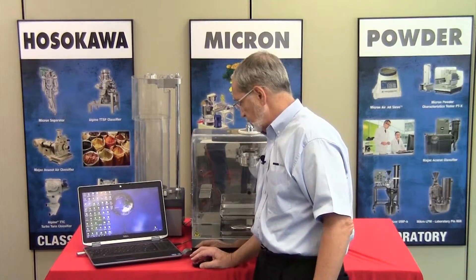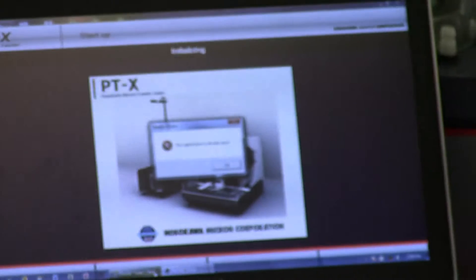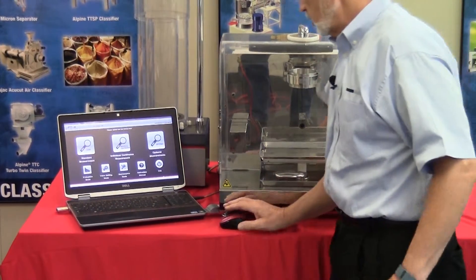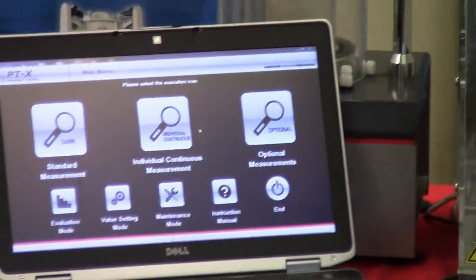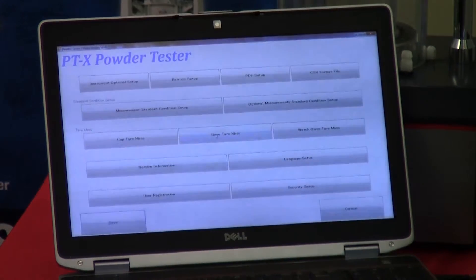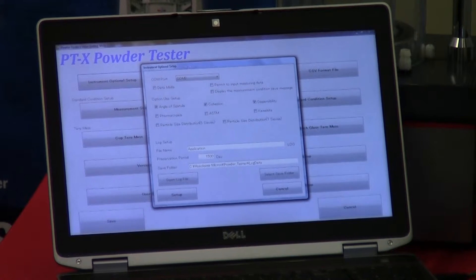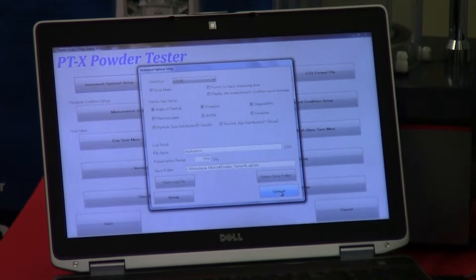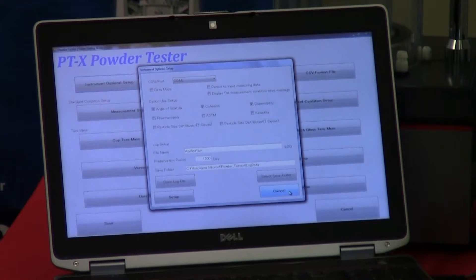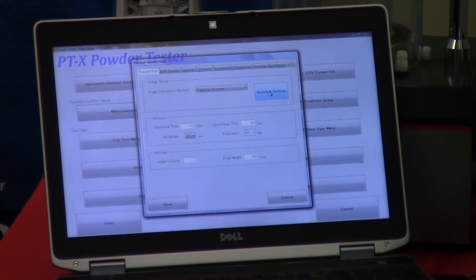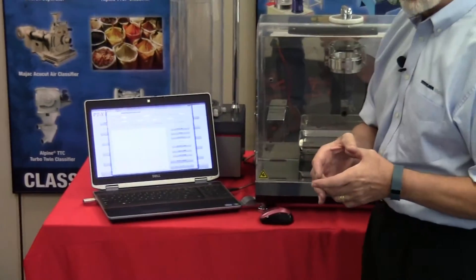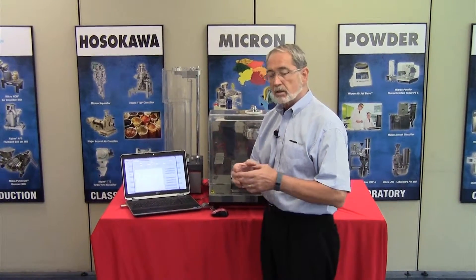Once the software has been loaded, double click on the icon and what will occur is that the light would have flashed three times. Then you will get the main menu. In order to proceed, we have to go into the value setting mode and make certain that the COM port has been set properly — we'll go through a more definitive video explaining this — because otherwise if that COM port is not set up properly the backlight does not flash and it does not communicate with the software. Additionally, we need to set up certain parameters such that the camera will provide the proper measurements, and we need to define the focal point for the angle of repose and the angle of spatula.